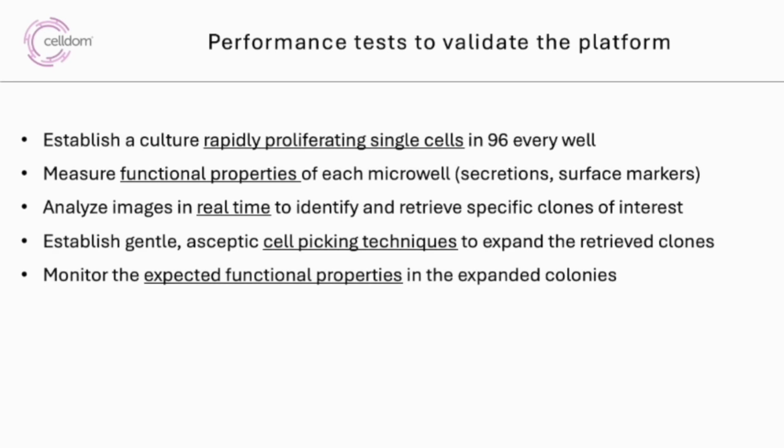And finally, we needed to show that the method can quantify the memory of a clone, which means we are asking the question of whether the cells that are expanded have the same properties as the cells that they were selected on. So let's take a look at each of these one by one.